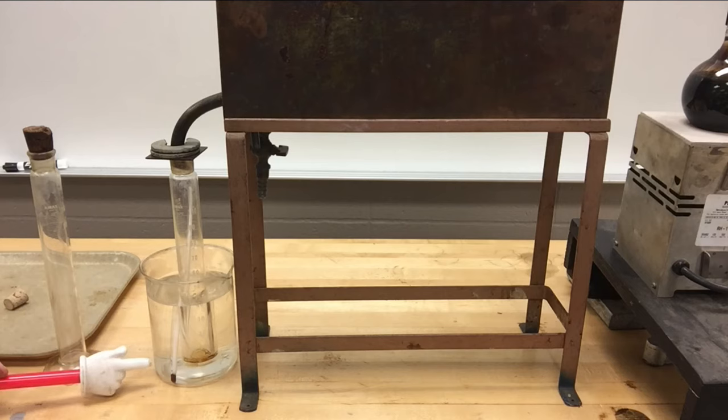My dripping is getting kind of faster now. I'm seeing it go drip, drip, drip, drip. So you can see it dripping. At 250, it's going a little bit faster now. So I'm starting to get into my naphtha fuel, which is heavy gasoline. And you can see it's starting to drip faster and faster and faster at this point.